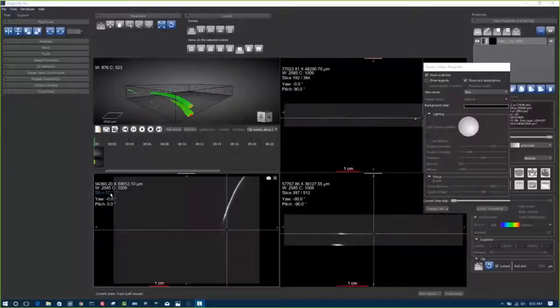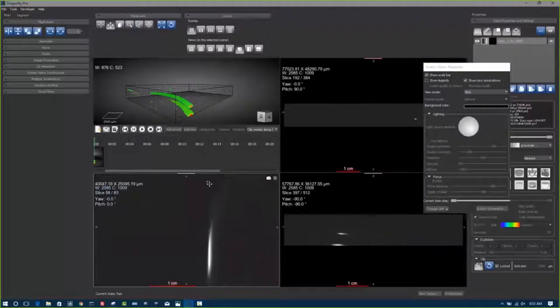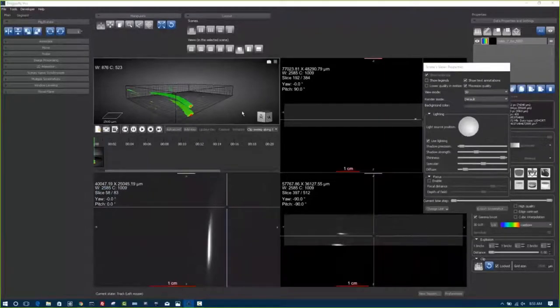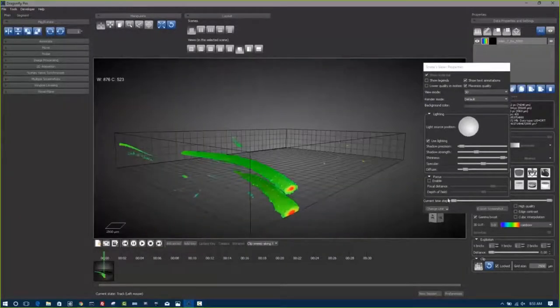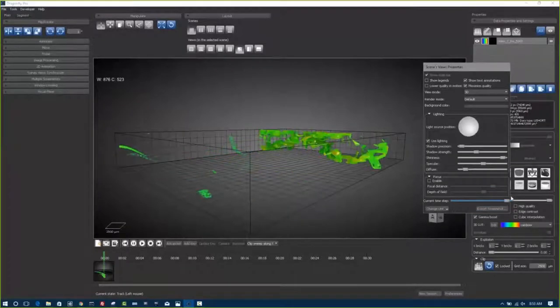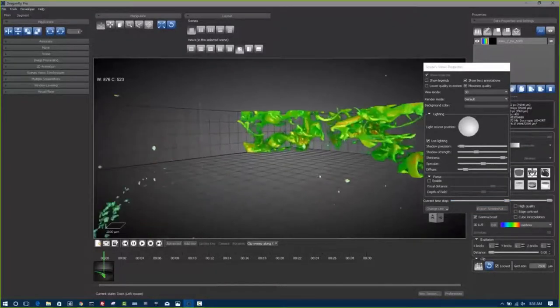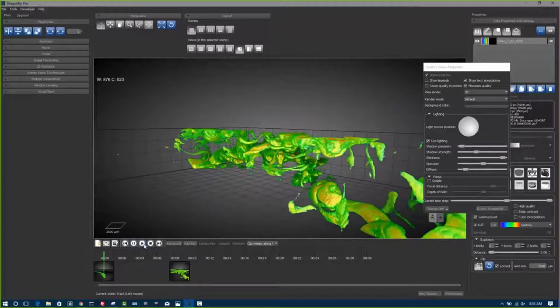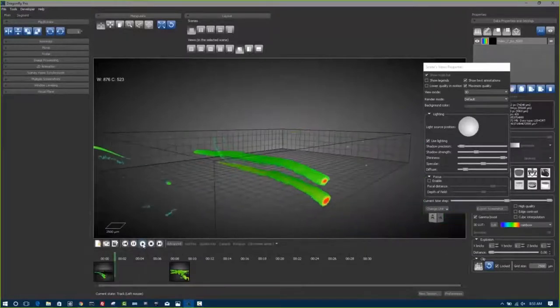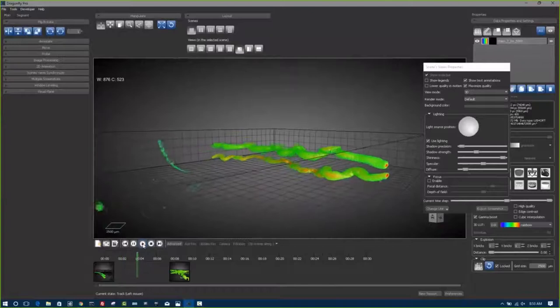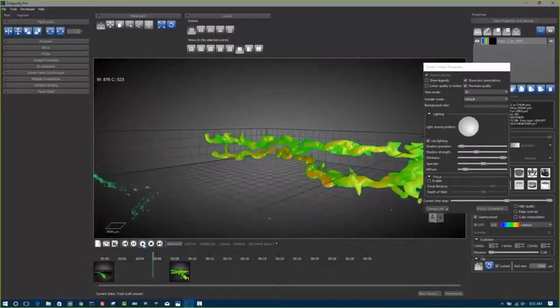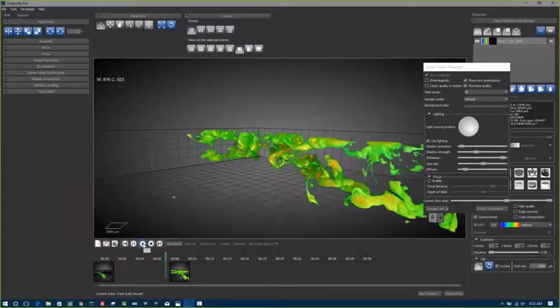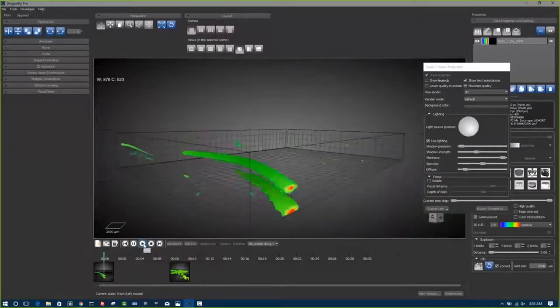I'll show a couple of short videos to give you an idea of what Dragonfly is in case you're new to it. Here's a four-dimensional data set from Ryan McCone at Harvard, where a user loads a 4D data set, interactively visualizes it, and changes the time step. To make an animation, you put one keyframe at time point zero and another at time point 500, and it animates — showing manipulation of 4D data sets.